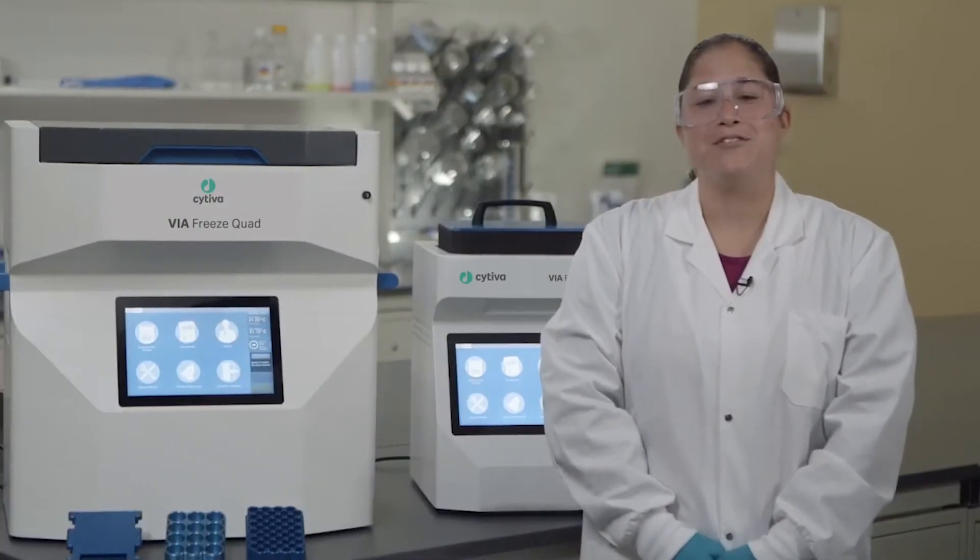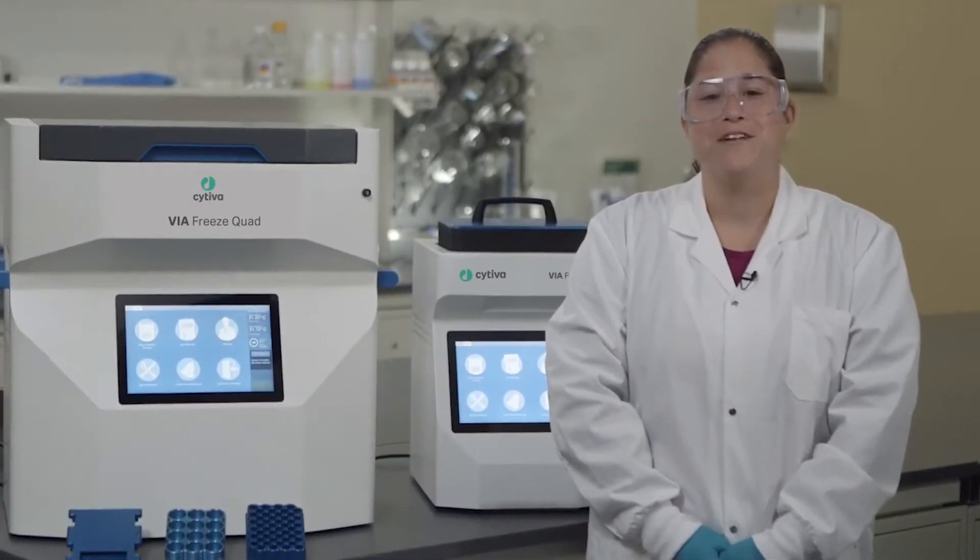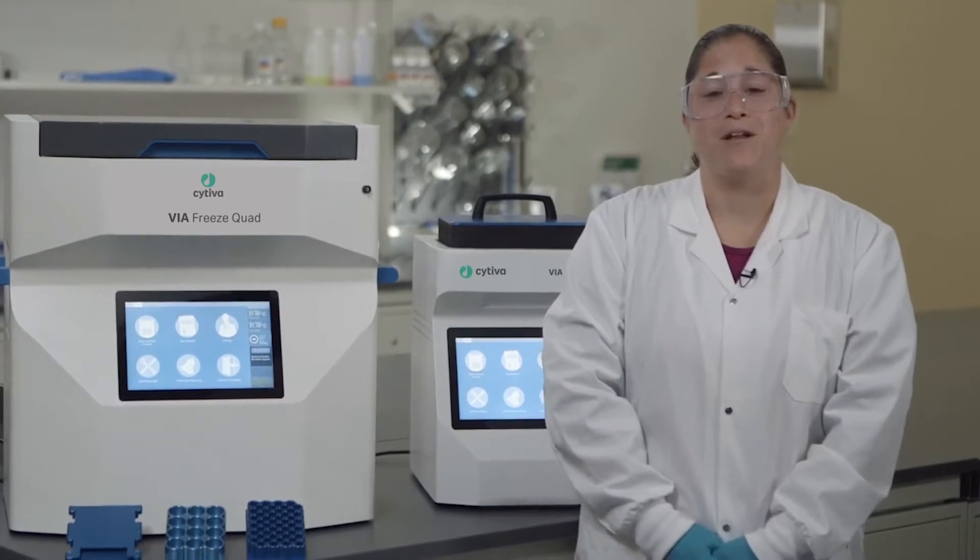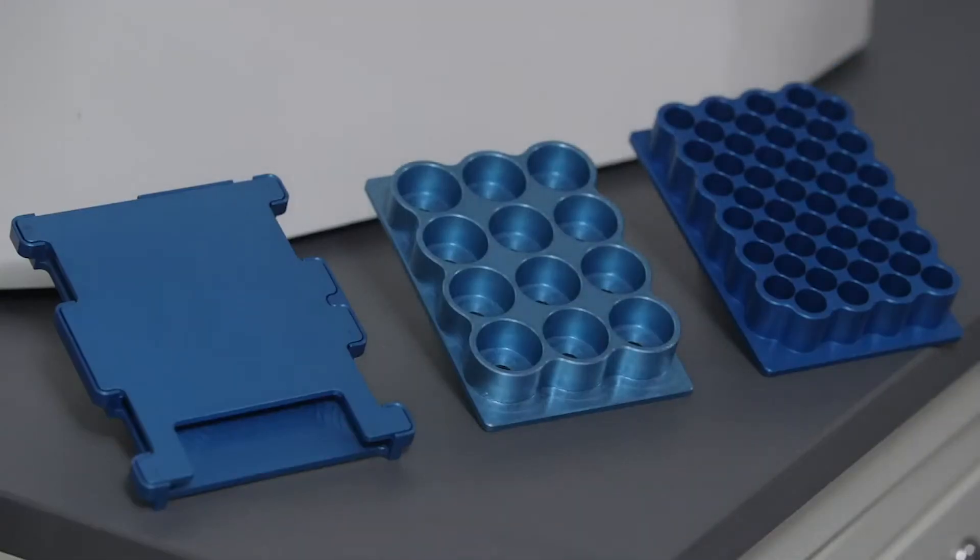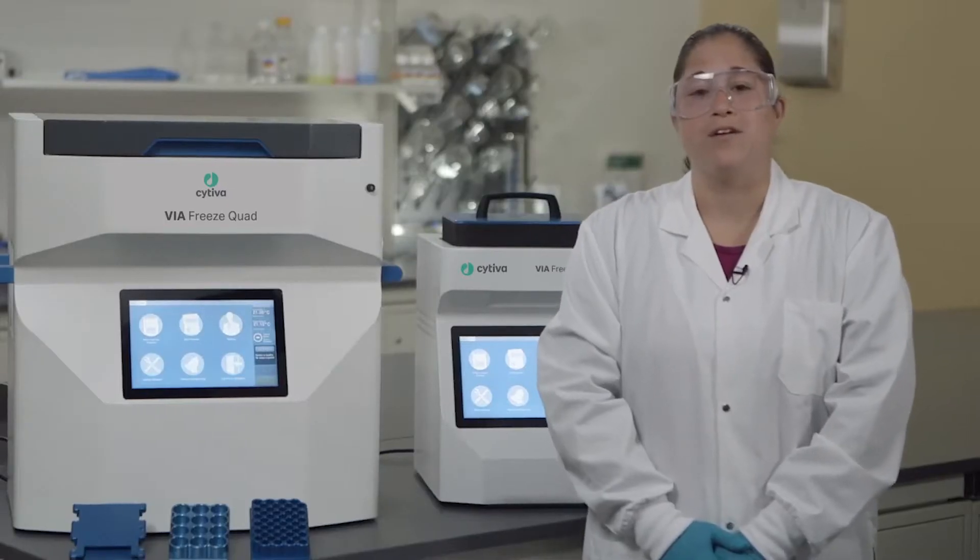The ViaFreeze is a liquid nitrogen free controlled rate freezer for the cryopreservation of cellular products. Aluminum plates designed to fit cryo bags or cryo vials are inserted and they can be custom made to fit a variety of configurations.